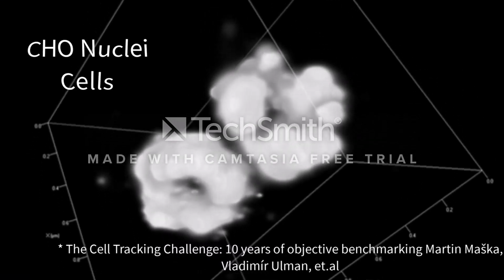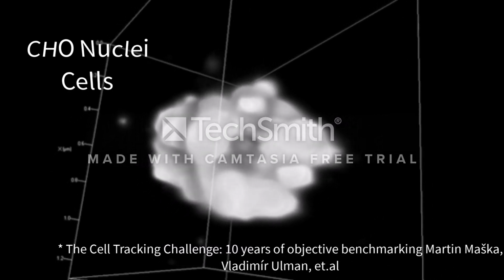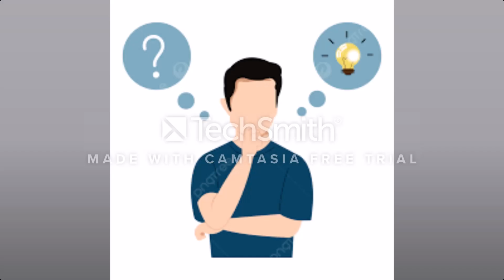In this example, we observe three-dimensional images of Chinese hamster ovarian nuclei. These cells are commonly used in biotechnology and pharmaceutical industries for the production of proteins, antibodies, and other biopharmaceuticals. One advantage of CHO cells would be their expression stability. This is crucial for consistent and reproducible production of the antibodies and proteins. A major disadvantage is that the process of developing a stable CHO cell line is time-consuming.